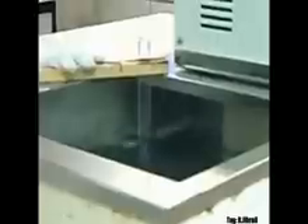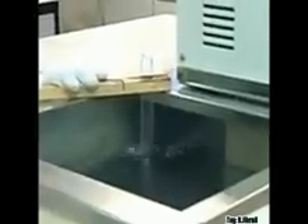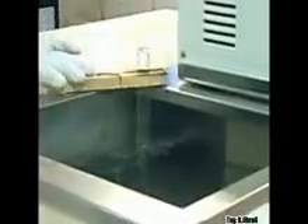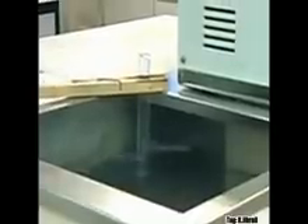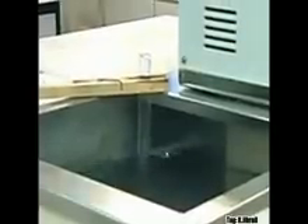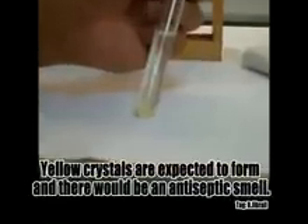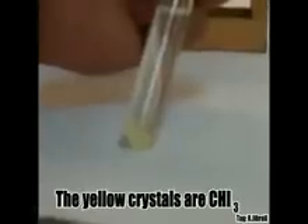Remove from the water bath and allow to cool. Note the colour and smell of the crystals formed. Yellow crystals are expected to form and they will have an antiseptic smell. The yellow crystals are CHI₃.